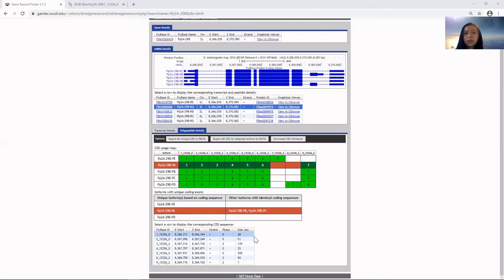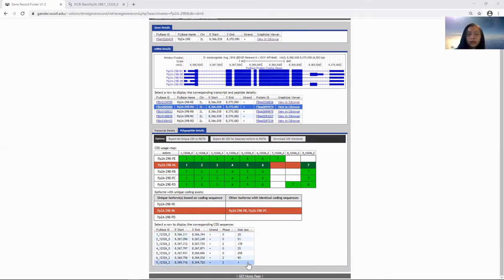Amino acid size includes the stop codon here in this table, but in reality that's not the case since a stop codon does not code for anything.